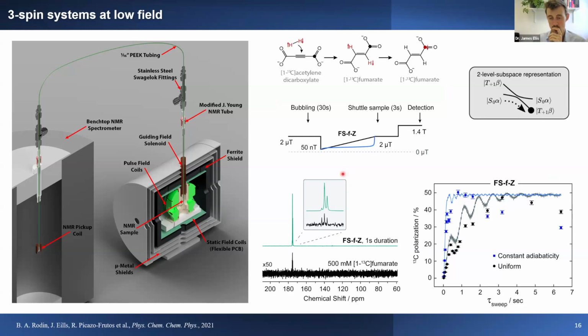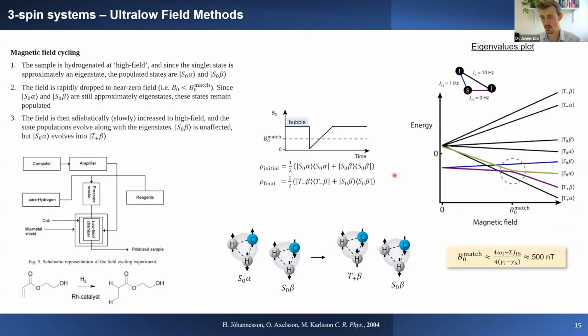Yeah, that's a great question. The first thing is relaxation: the lower the magnetic field, the more efficient relaxation from paramagnetic species becomes. So if there's oxygen in the solution, oxygen is paramagnetic, and so relaxation would be faster. But to be honest, the real reason is that it's a cleaner way of doing the experiment, because at zero field, let me jump back.